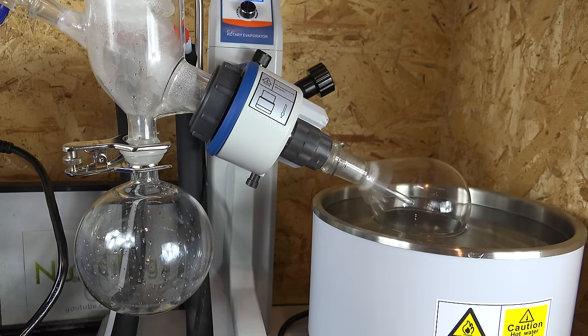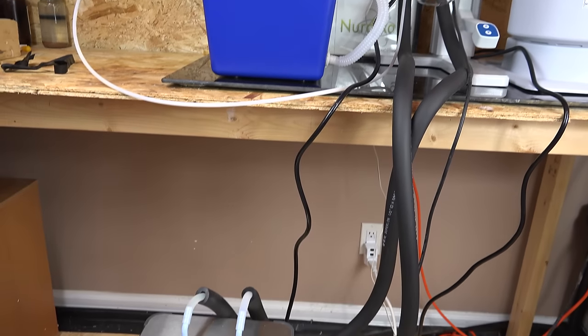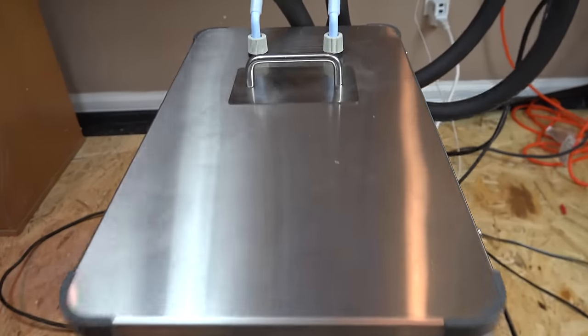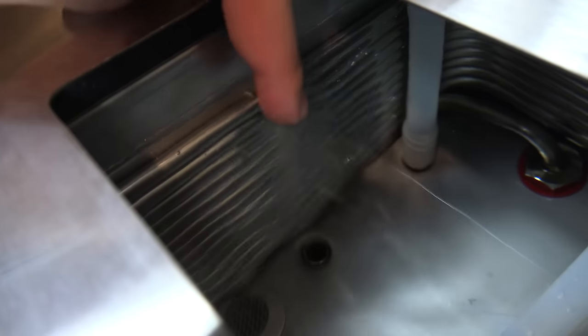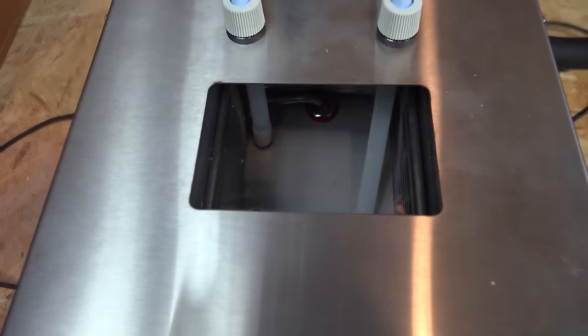If you're rotovaping a high boiling solvent like water or xylene, a water-cooled condenser is sufficient. But if you're dealing with a very low boiling point solvent like acetone or diethyl ether, room temperature cooling water is too warm to effectively condense it all at the high rate it's being boiled off. The answer is to chill the coolant down to below room temperature — I have that unit connected by those two insulated black coolant lines. It's pretty much a refrigerator focused on cooling a tiny reservoir. You can see the metal refrigeration coils inside; I've currently filled it with water, although for sub-zero temperatures you can also fill it with alcohol or ethylene glycol antifreeze mixture. These chillers also have their own integrated coolant pump, which is very convenient.